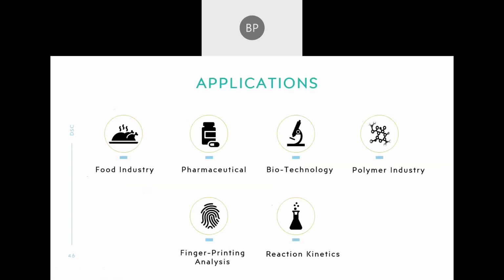Next, applications. As discussed, DSC has many applications in many fields such as the food industry, pharmaceutical, biotechnological, polymer industry, fingerprinting analysis, and reaction kinetics. Let's see some of the applications in the upcoming slides.